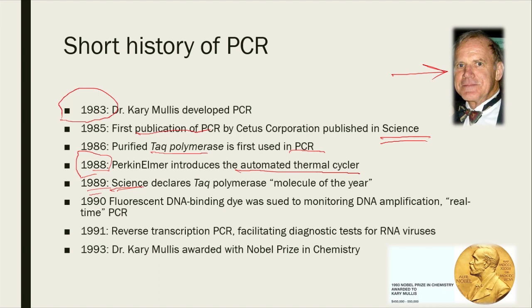And then further down there are modifications, or small incremental improvements, in the reactions using fluorescent DNA dye that was used. Sorry, there's a typo there. Apologize for the typo. I will make sure the student versions will be corrected. It was used to monitor DNA amplification, so-called real-time, and in a sense laid the pathway for real-time PCR.